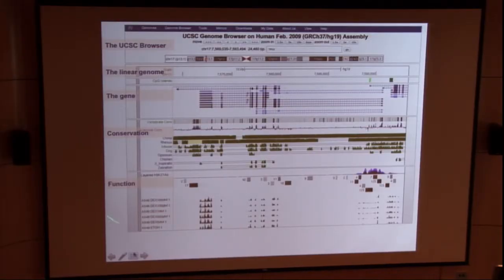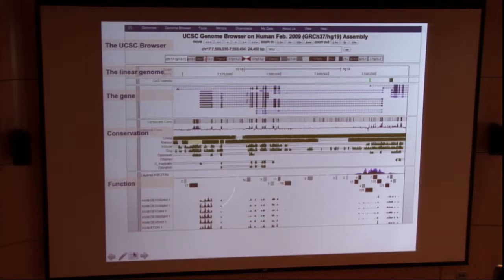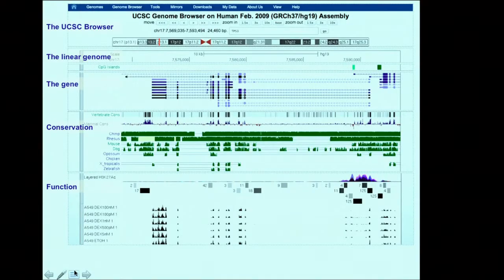Over here, this is where things start to get complicated. When we start annotating the function of the genome, the enhancer state, the transcript, the RNA-seq data that was just asked about, they showed up as browser tracks on this. And then it really helps us to understand this part of the genome. What does this part of the genome do, right?